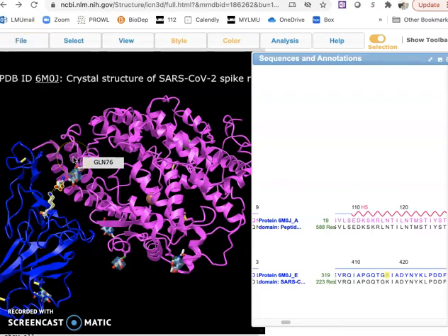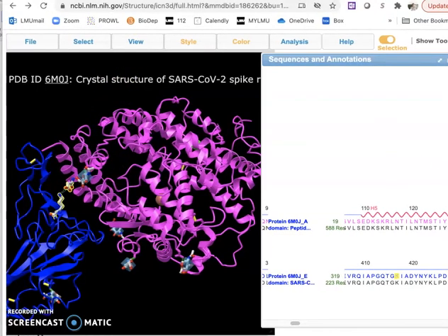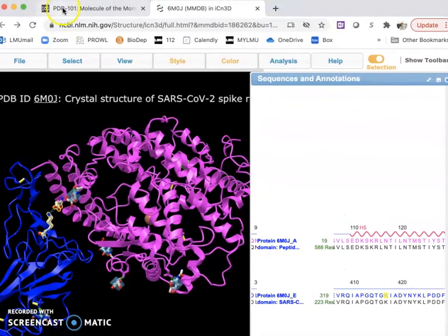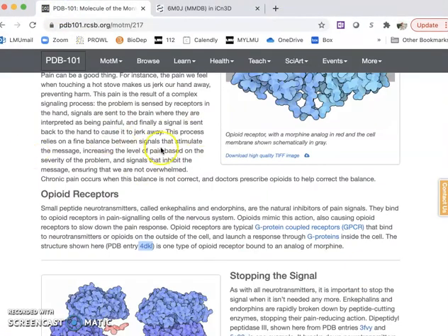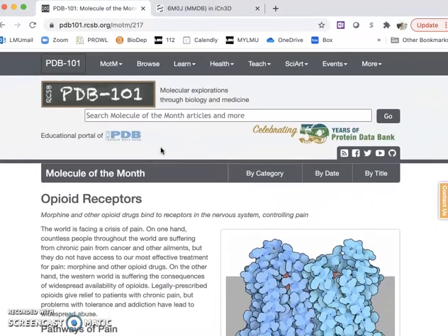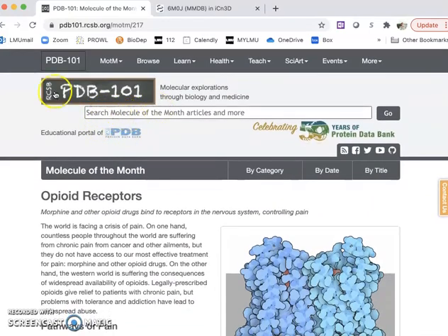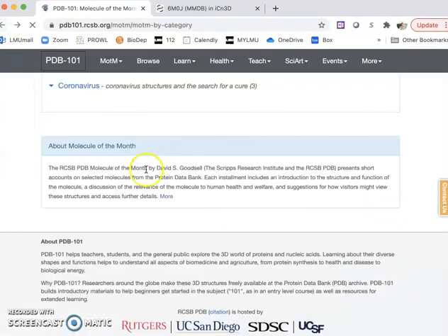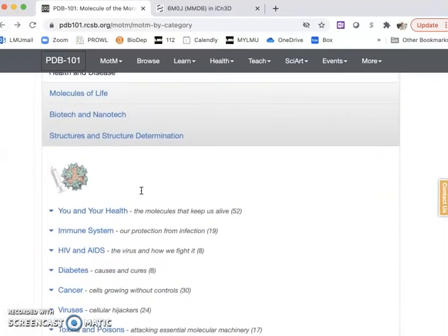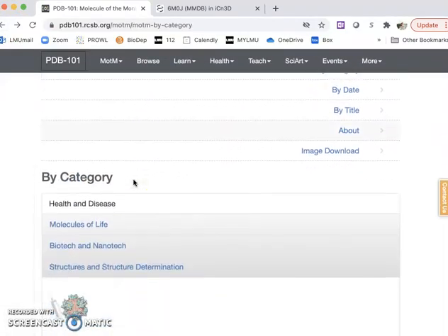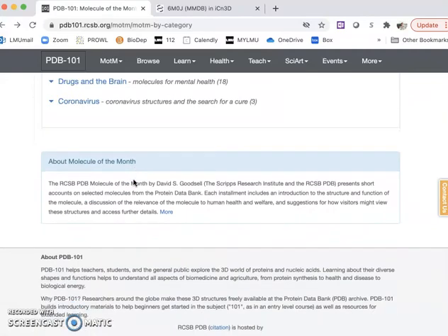If you want to visualize any other protein, you could use this database to just find any molecules you can think of by category. I just clicked by category and went into drugs in the brain, and I picked opioid receptor.